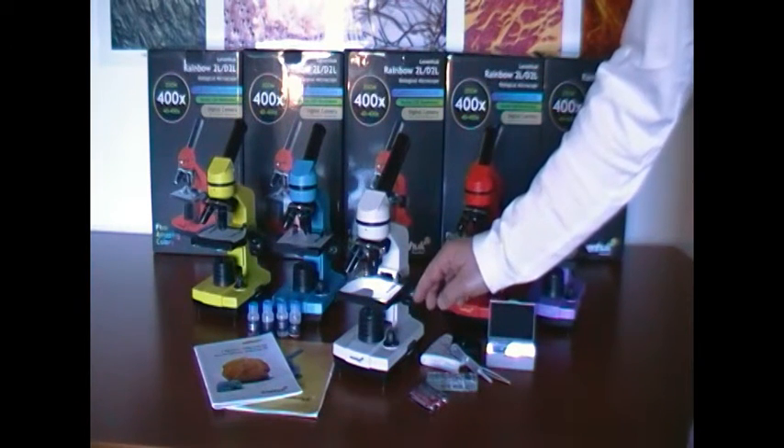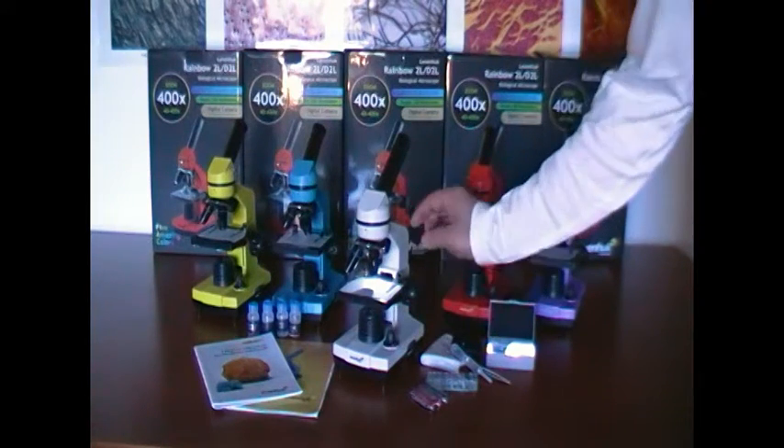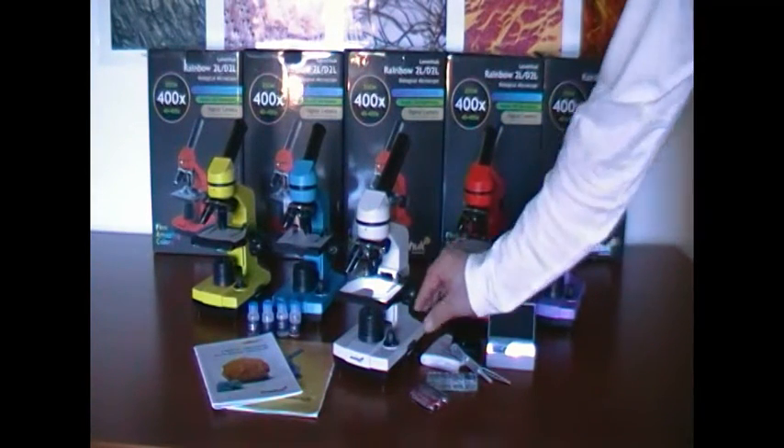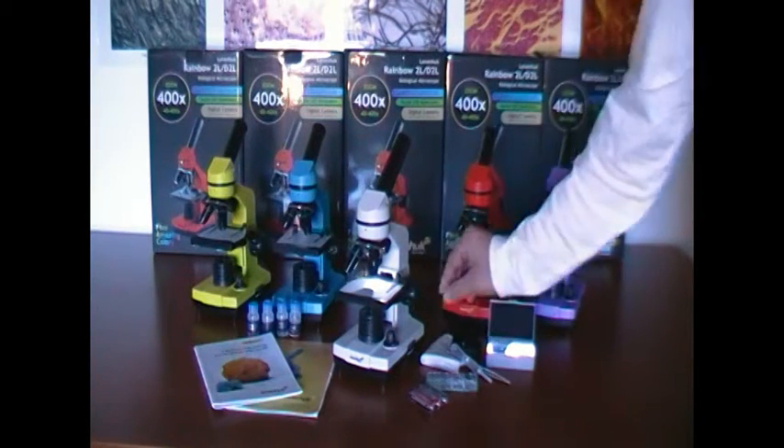This microscope has a top and bottom LED backlight which can be controlled separately to provide illumination from above, from below, and I can also control the light intensity.